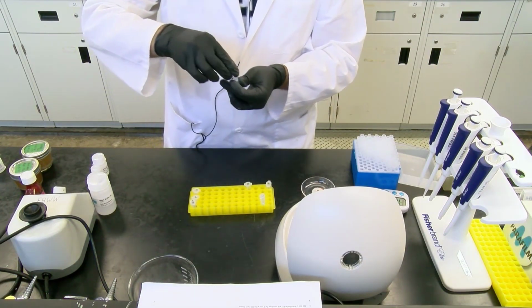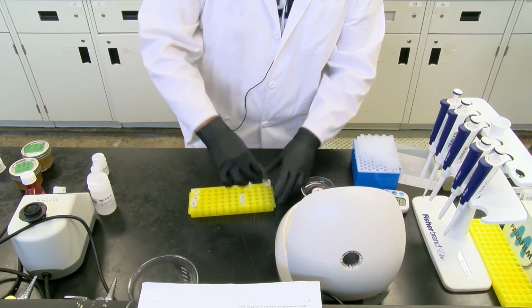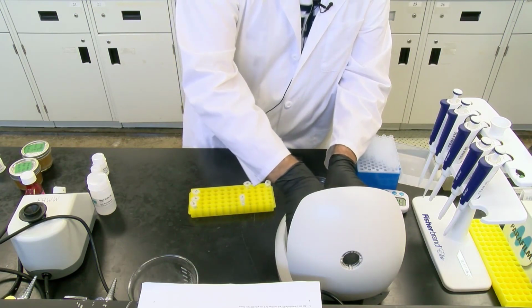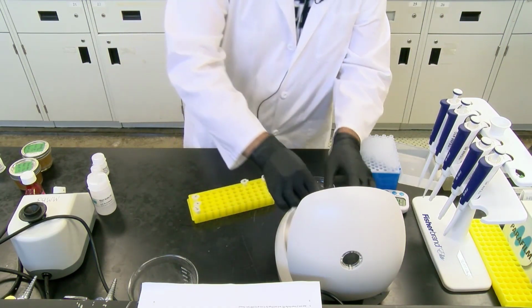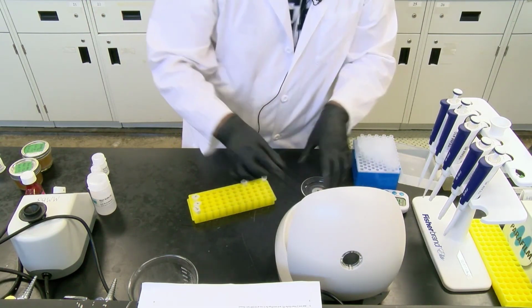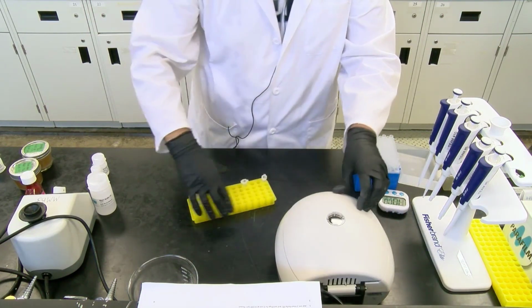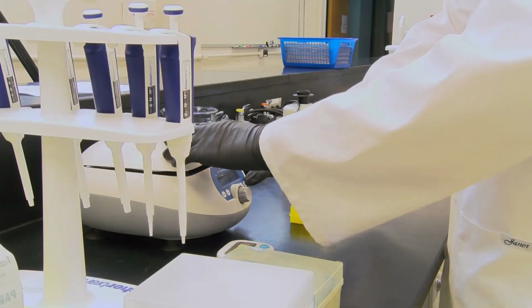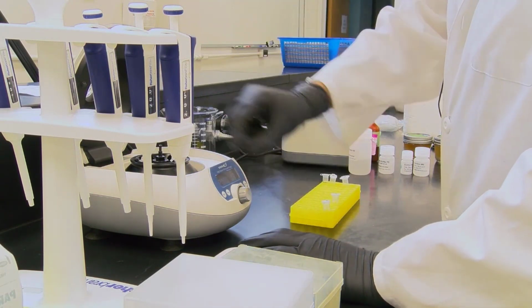And now we're going to do one last step. We're going to spin it for 3 minutes this time to ensure that it's dry of ethanol. So we're going to spin it one last time, this time for 3 minutes with the same spin conditions. And let's set this to 3 minutes. Alright, so now that we've done the 3 minute spin, we are good to go with the wash steps.